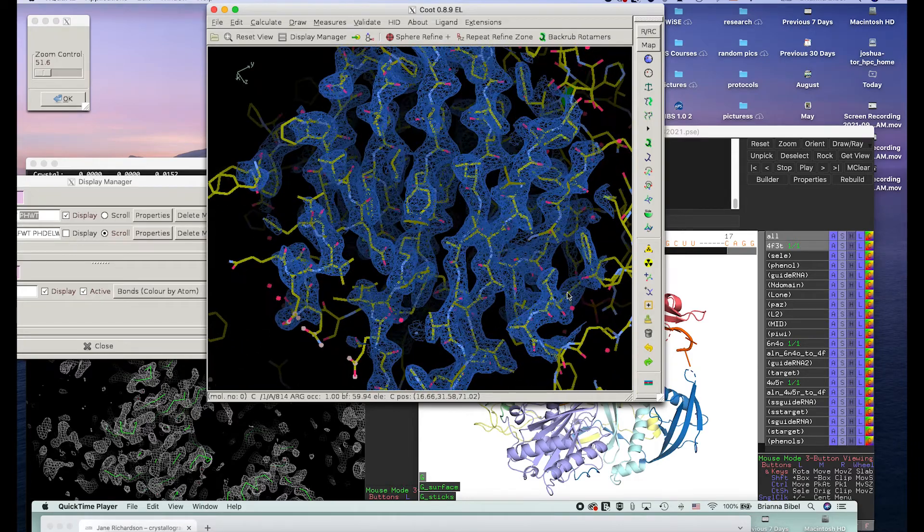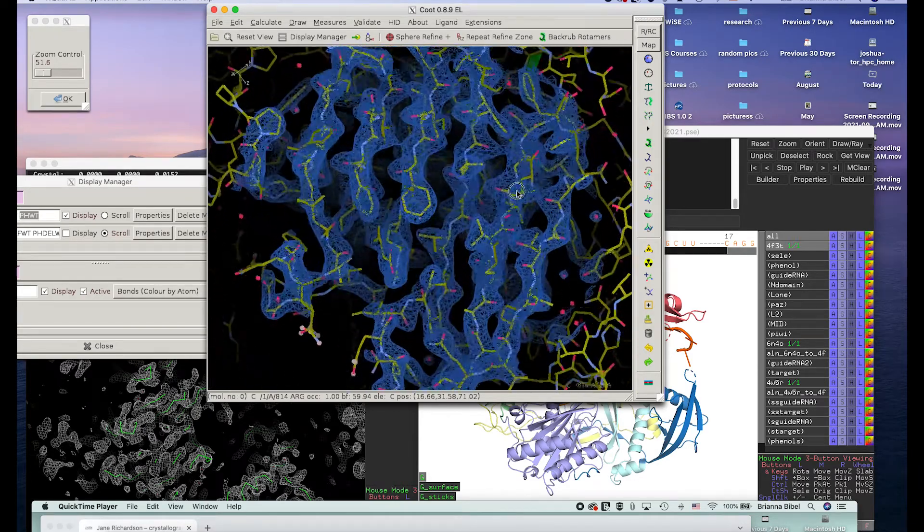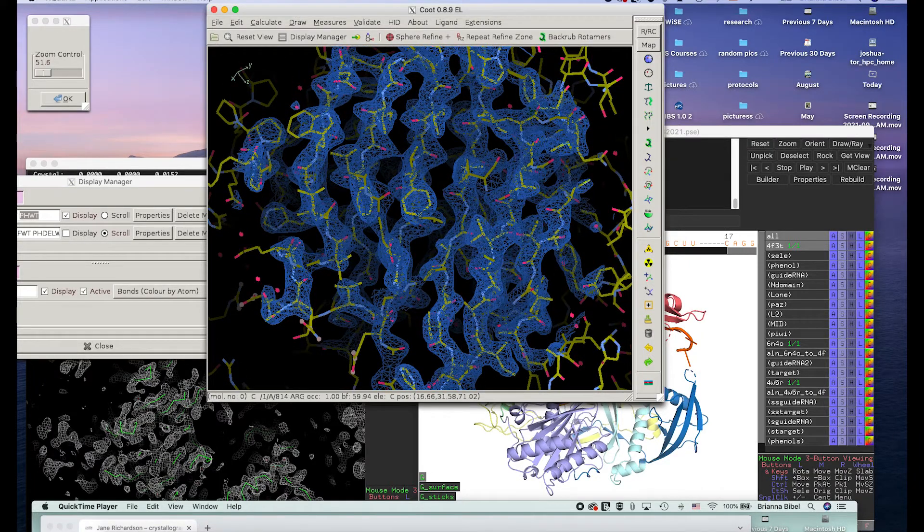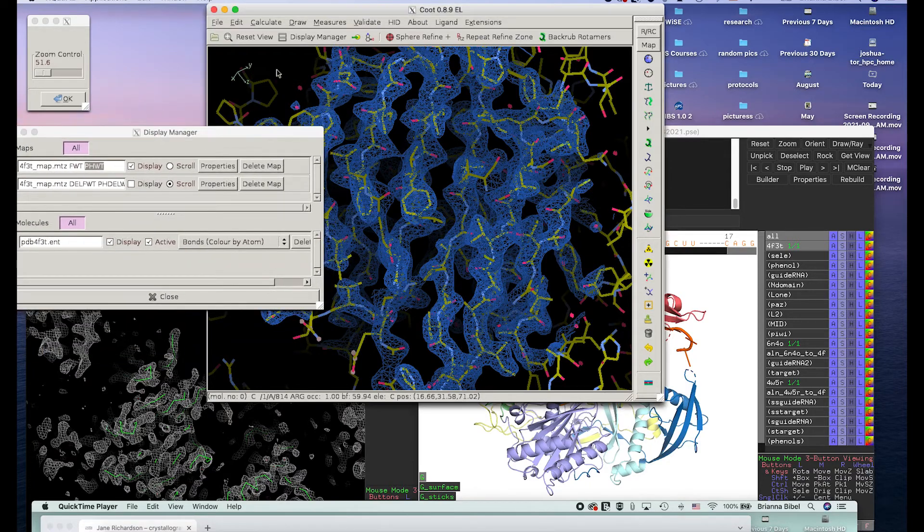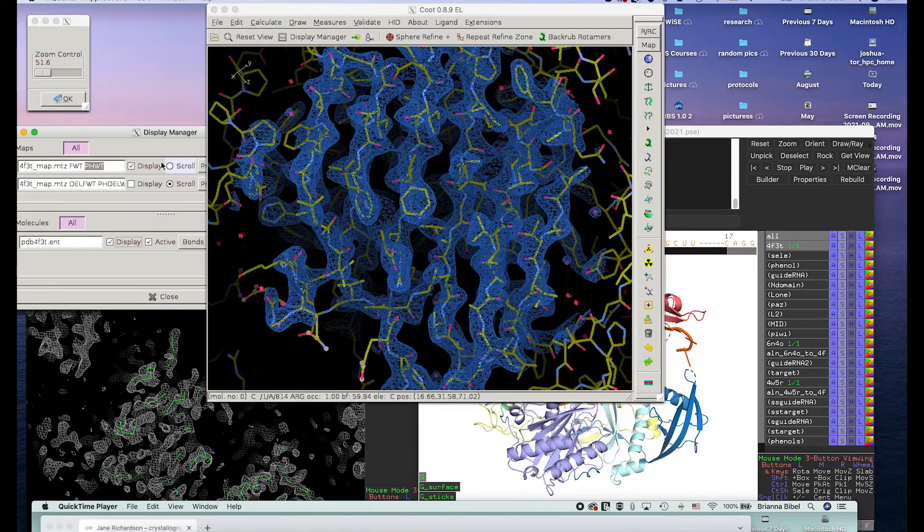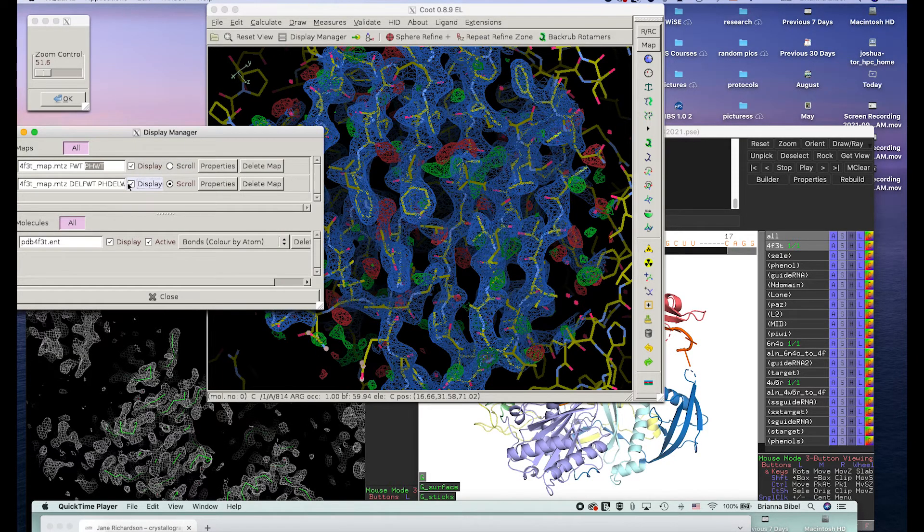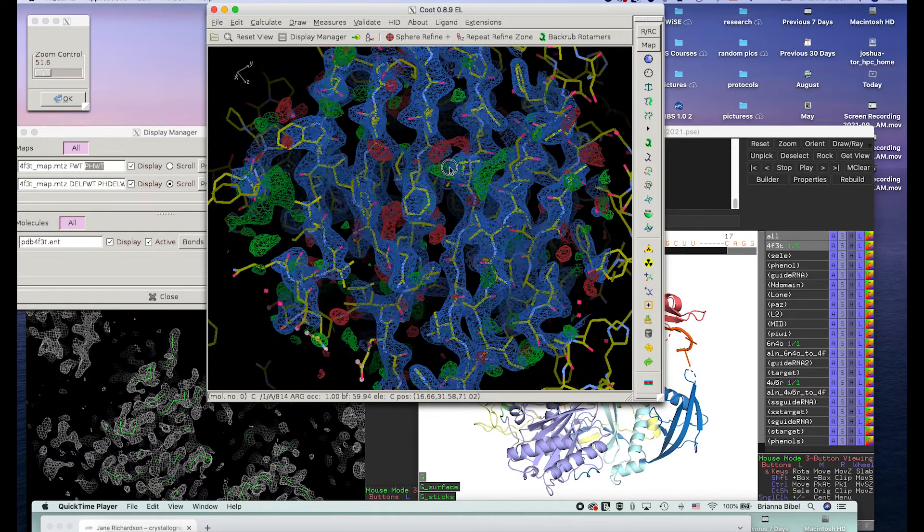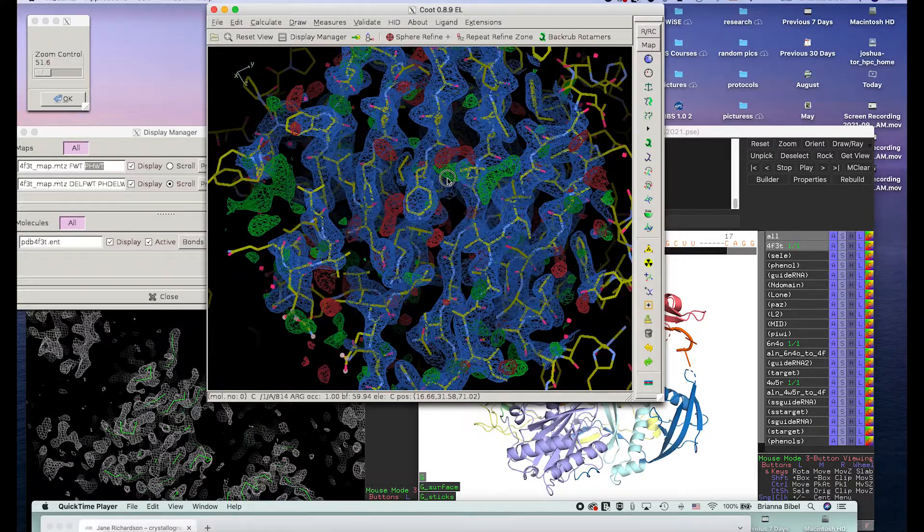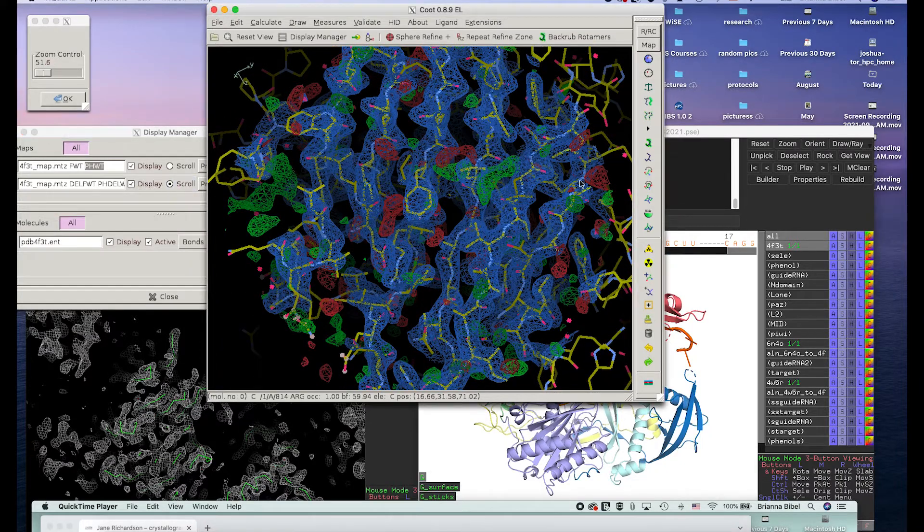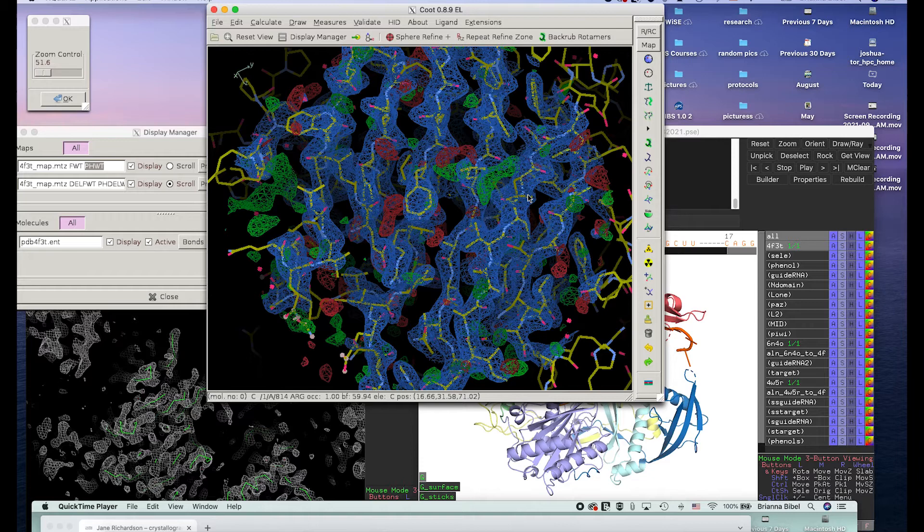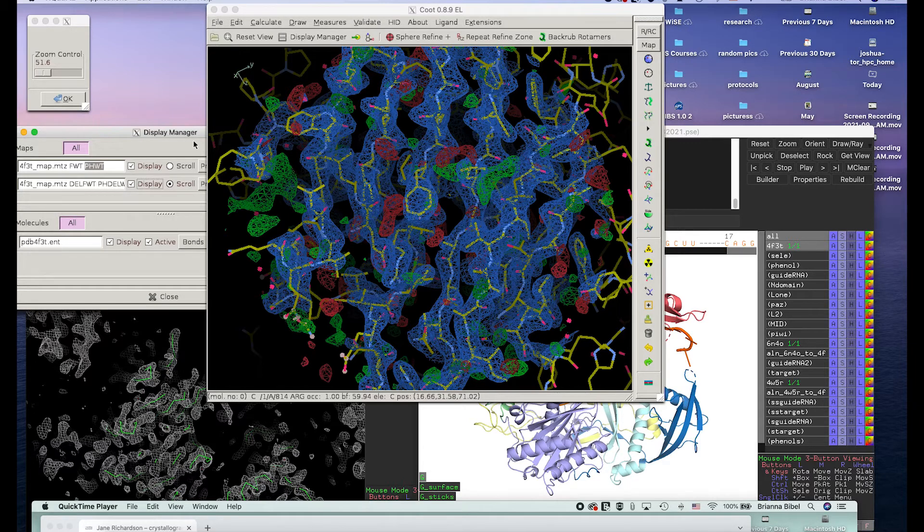So you'll often see things like R-work and R-free, so R-free is from the data that you left out. So what we're showing here, this is a 2Fo-Fc map, so 2 times the observed minus the calculated. We can also show just the Fo-Fc, so observed minus calculated, and this helps show where there's regions that may be something missing in the model or there's something that the model needs to have, maybe a side chain should be going in a different direction or that sort of thing.